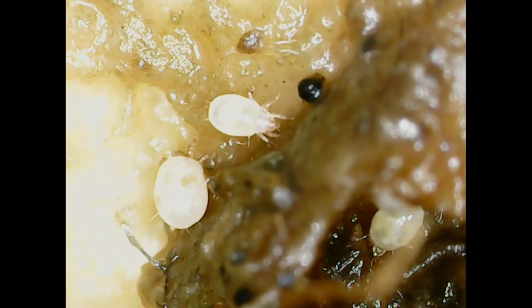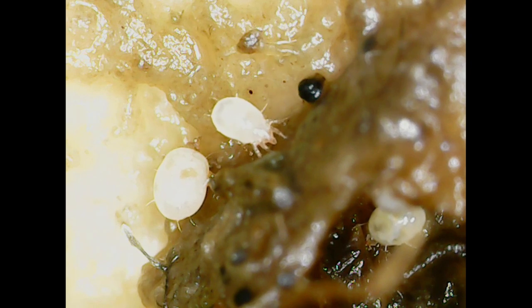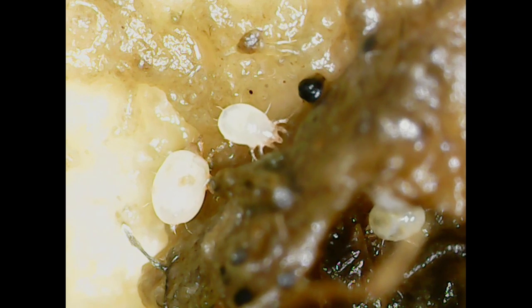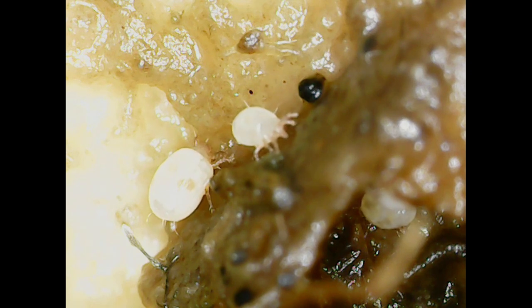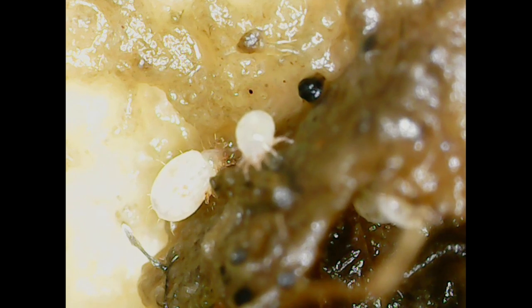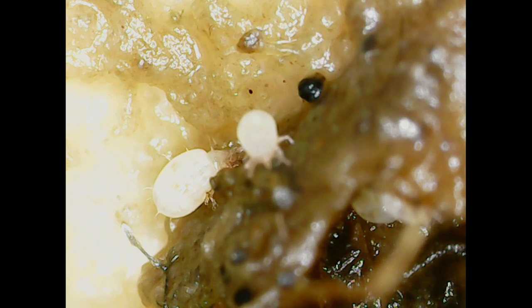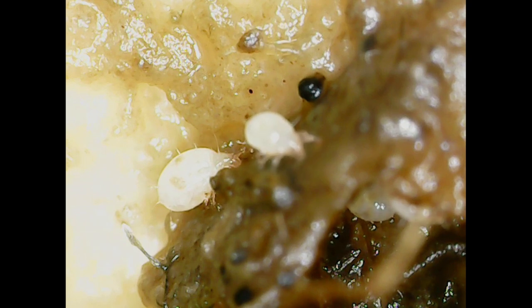Oh good, they're almost in the same field of view here. Almost the same focus distance. Look at them go. These are just your basic white mites. I don't know the actual scientific name of them, but you see them in every single worm bed. Pretty cool. This is a neat little microscope. Not the best, but I like it a lot for what I need it for.